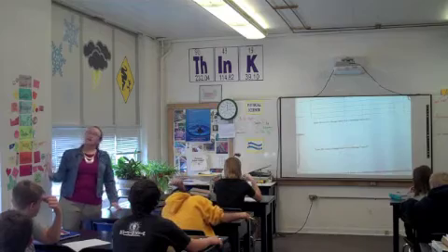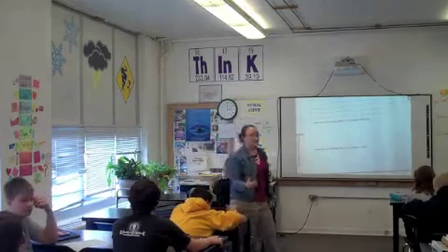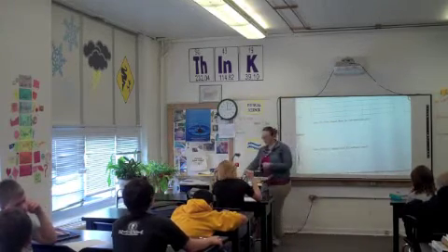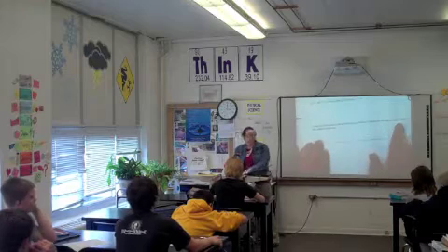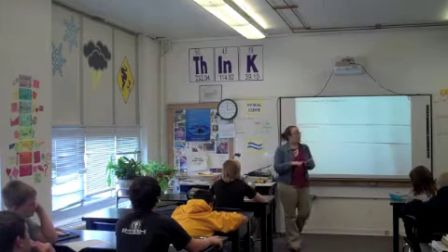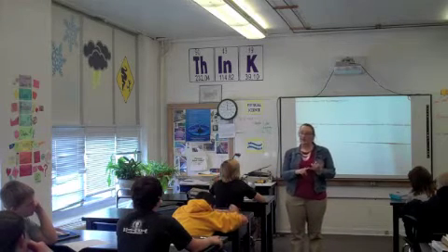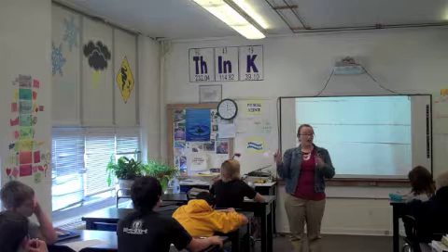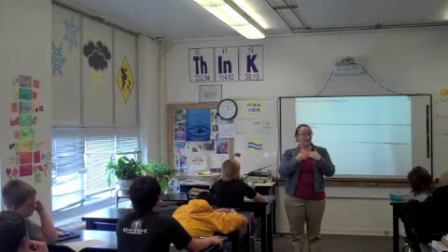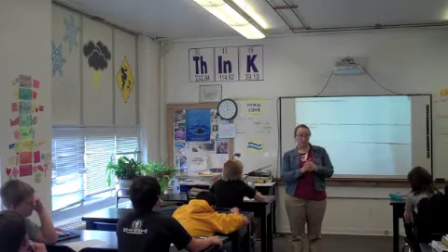Once you make the chart, then you become a real scientist, because then you're going to test an unknown. That's the very last thing. We might not get to it until tomorrow. I'm going to give you an unknown sample, and you have to report back to me the pH, not using pH paper, that'd be too easy. Using your natural indicator, your universal indicator, and that color change chart you made, I want you to figure out the pH. I know the pH of the sample. I want you to figure it out using your color change chart.